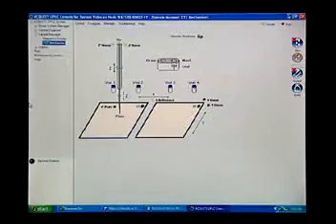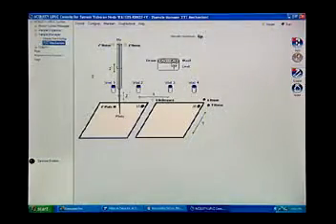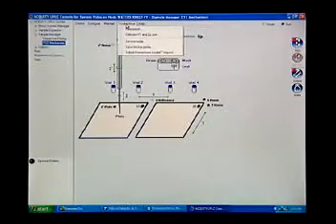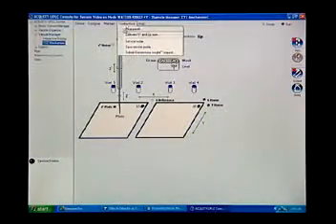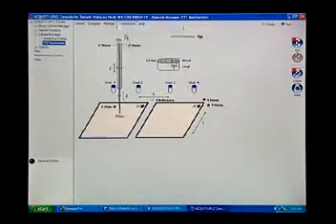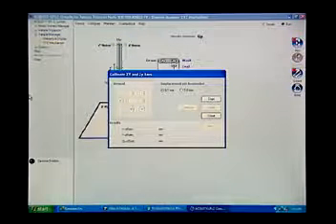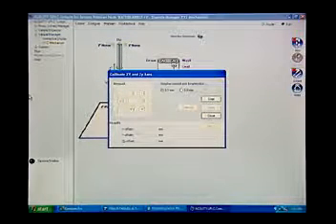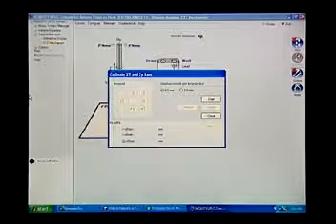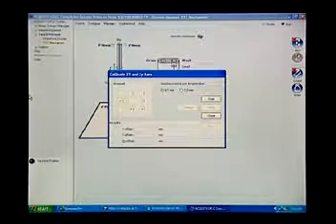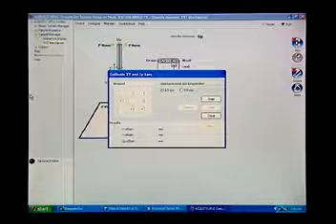Next, select Troubleshoot, Calibrate XY and ZP axes. The Calibrate XY and ZP axes dialog box appears. Click Start to begin.